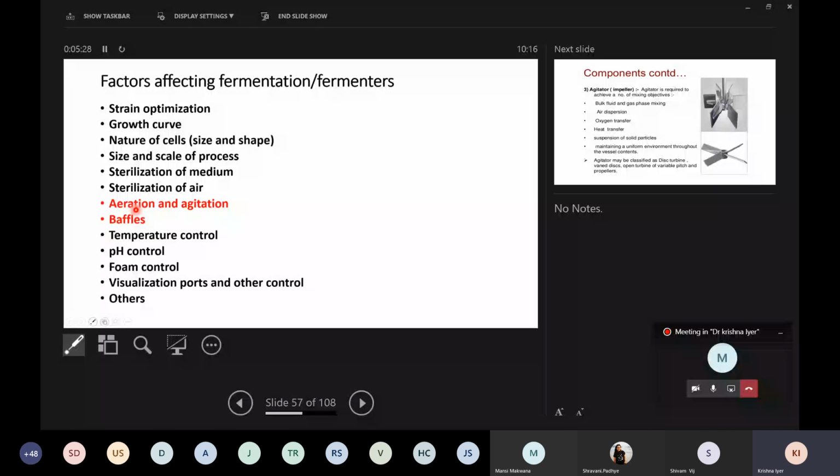In fermentations which are aerobic, many times the design of aeration and agitation systems are done together, in tandem, realizing that both of these are required. And in case of anaerobic fermentations, the only worry we generally have is agitation. Okay, but how do we do this?